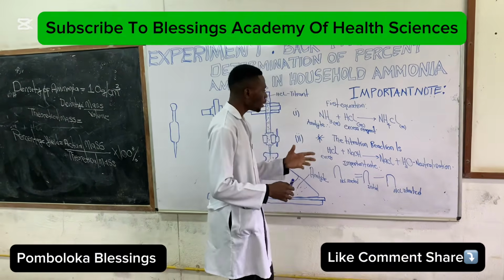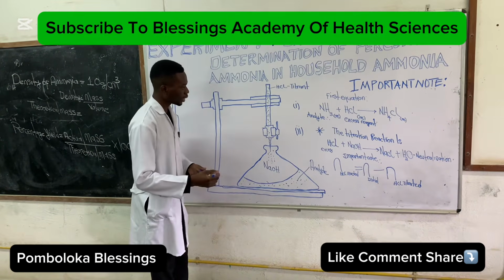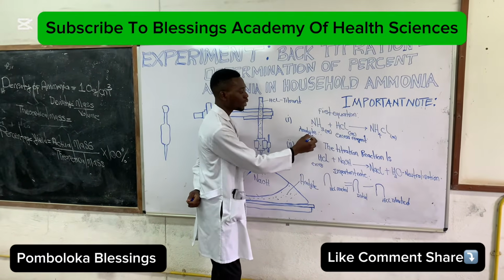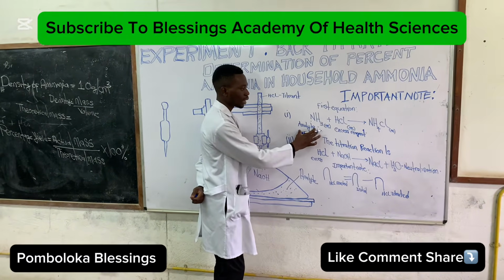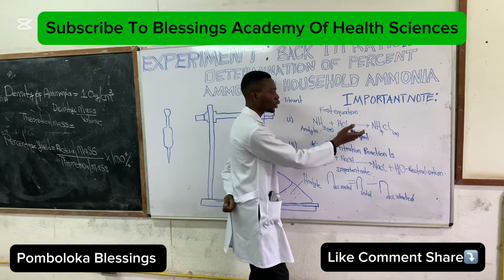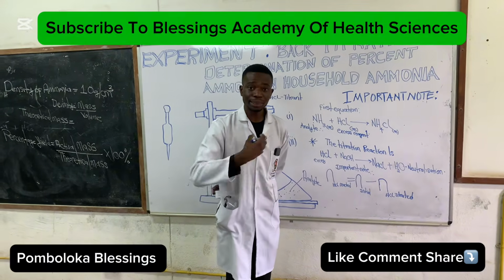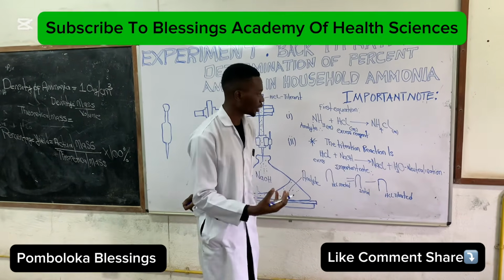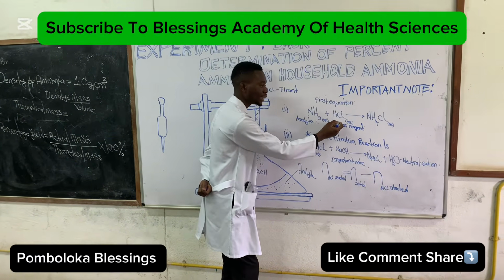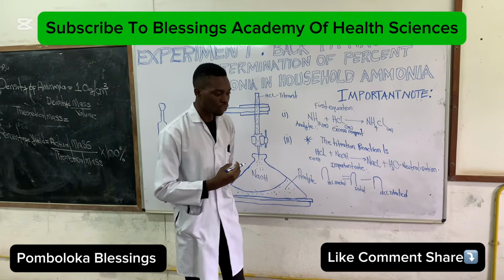In the first part of the reaction, we're going to mix 5 cubic centimeters of the ammonia, which is the analyte here, with 25 mL of the hydrochloric acid, which is going to give us that product. I want you to understand something in back titration. This is the basic principle: you are going to be given the concentration of the HCl, and you are also going to be given the volume of the HCl.